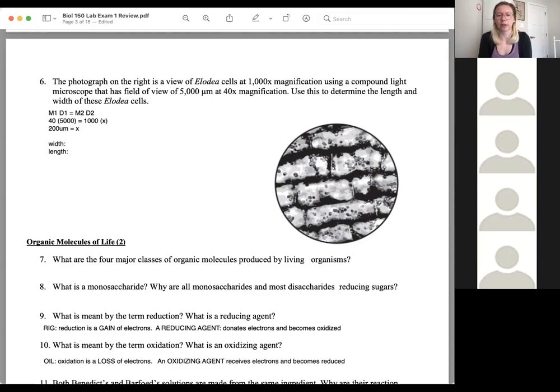This isn't exactly a whole cell, it's just missing a little bit, but we have a little extra bit over here, so it's almost like 2 whole cells. So 200 micrometers divided by 2 cells to reach across, the length of one cell is approximately 100, let's say.